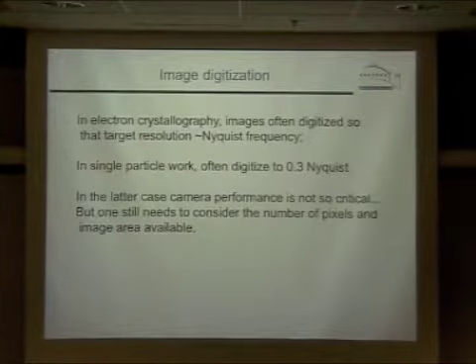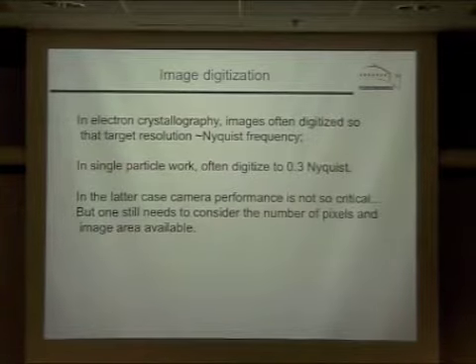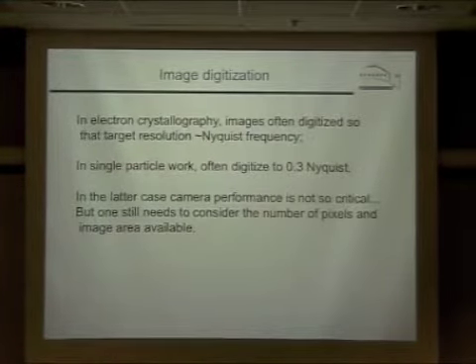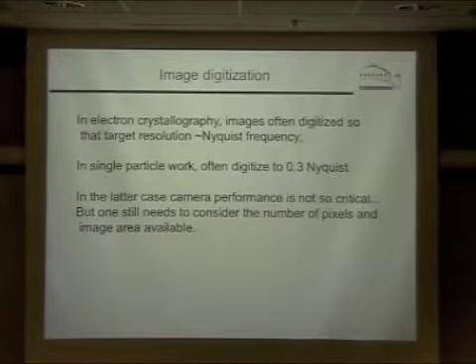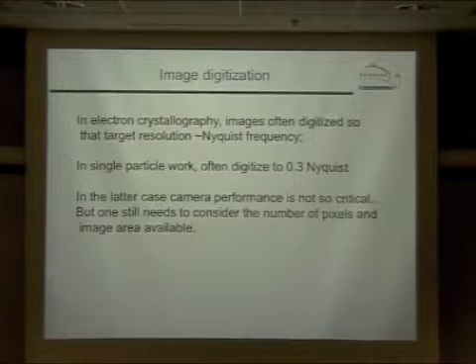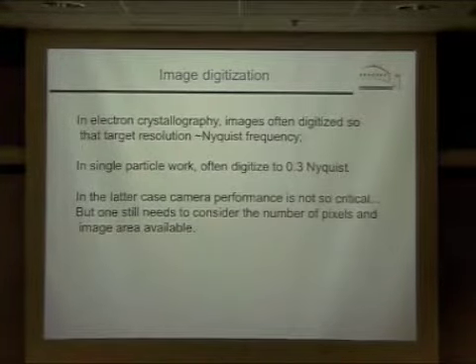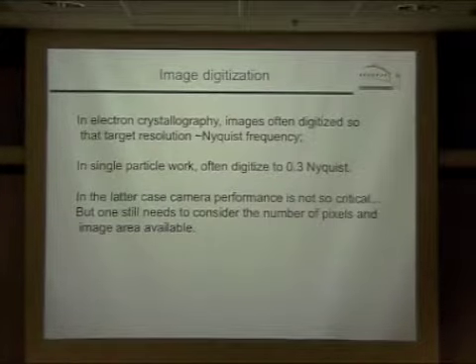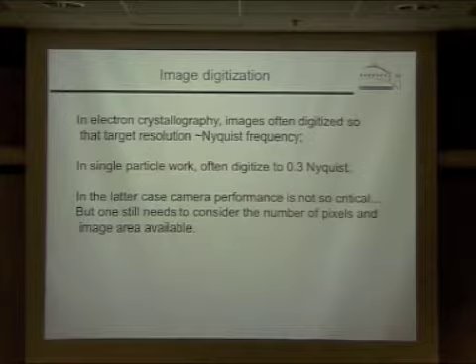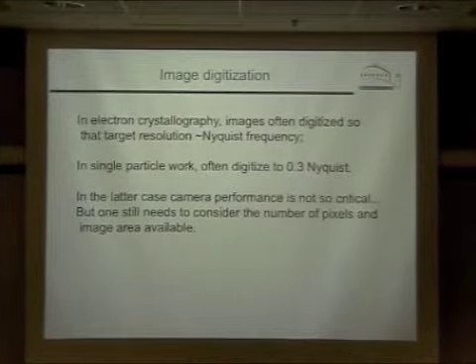So there are other reasons for doing that, which have to do with the fact that anytime you do an image interpolation or rotation or rescaling or something, there's another MTF that's a lot like the digitizing MTF that decreases the contrast, particularly near the Nyquist resolution. But that decreases both the signal and the noise, so I don't think that's a strong argument for really oversampling the image so that you have signal only out to a fraction of the Nyquist frequency.